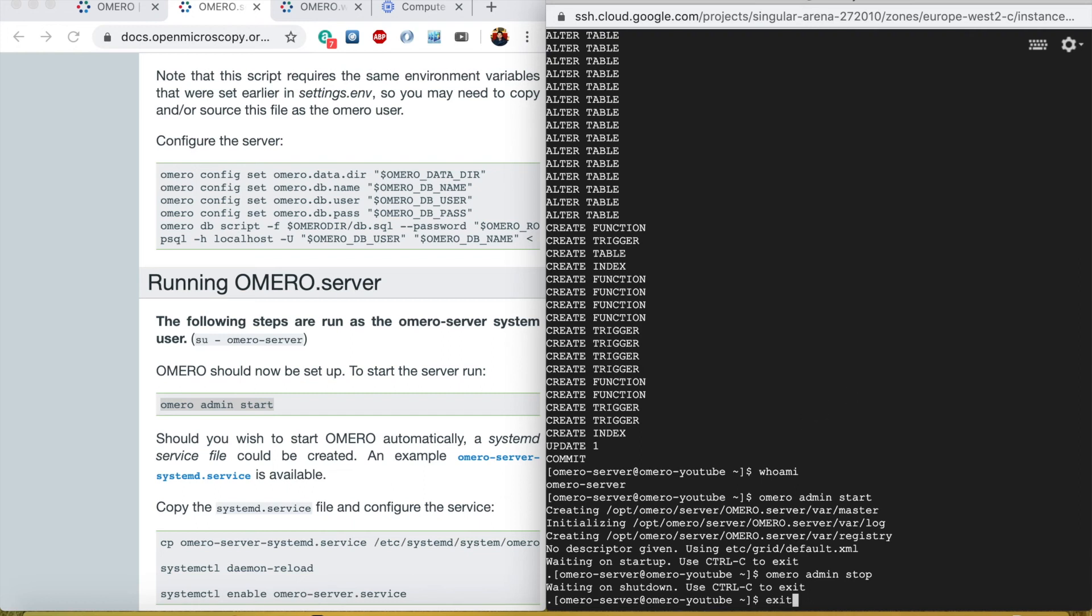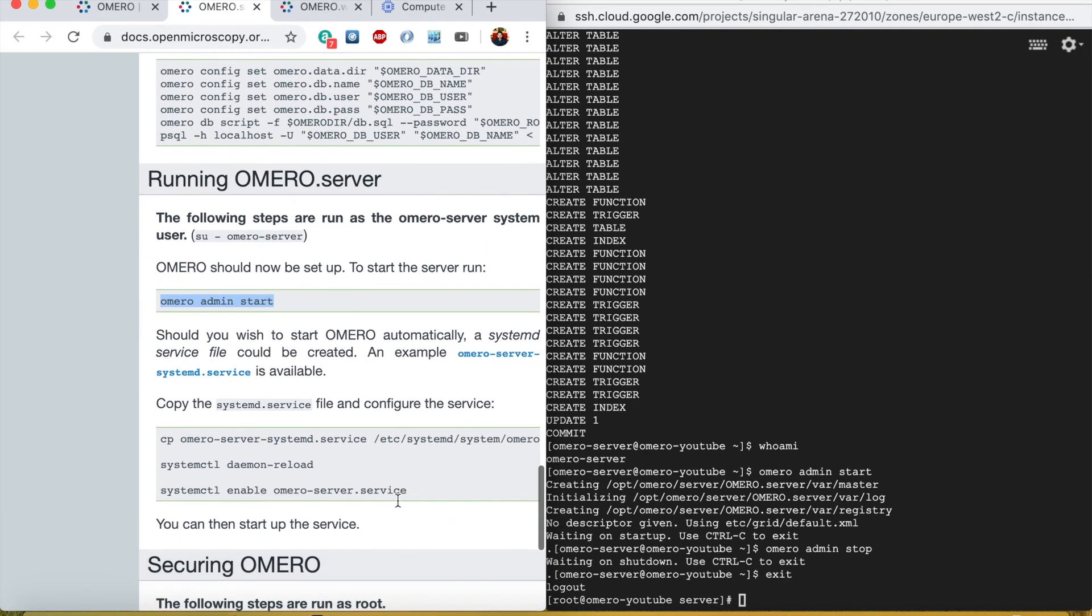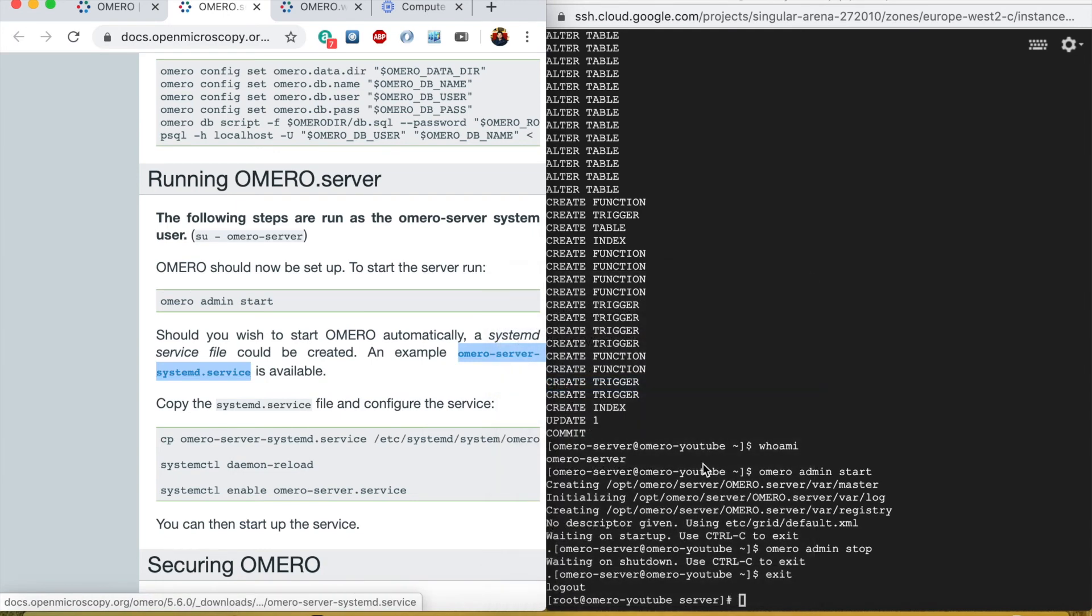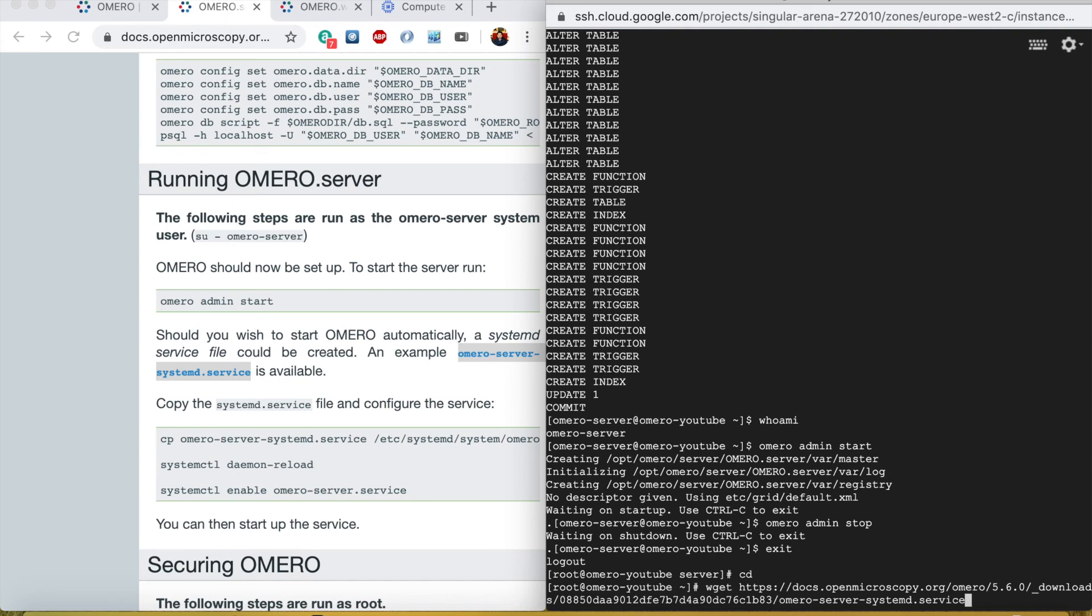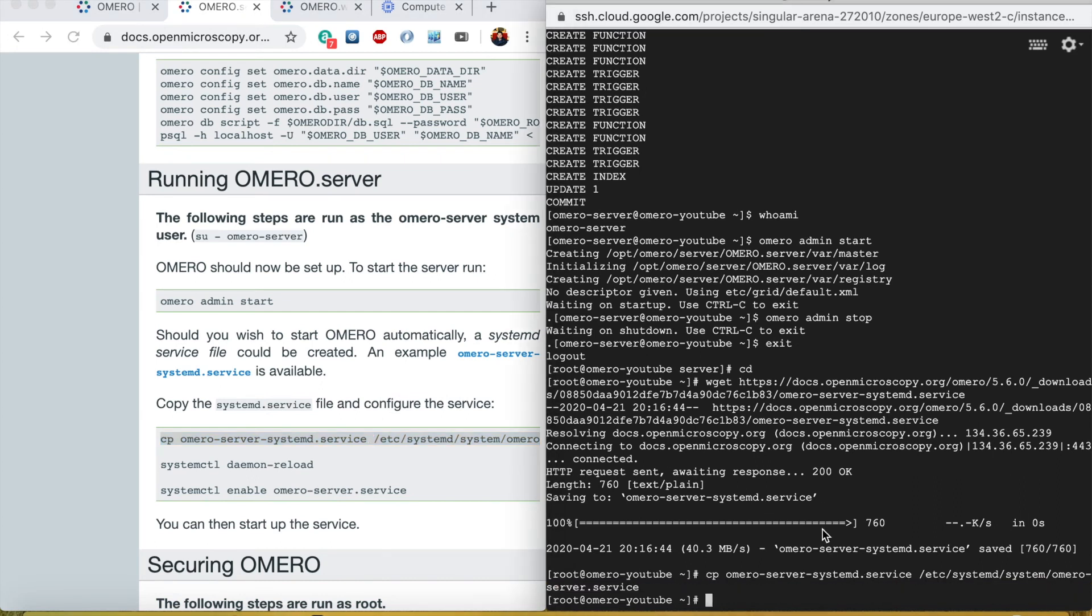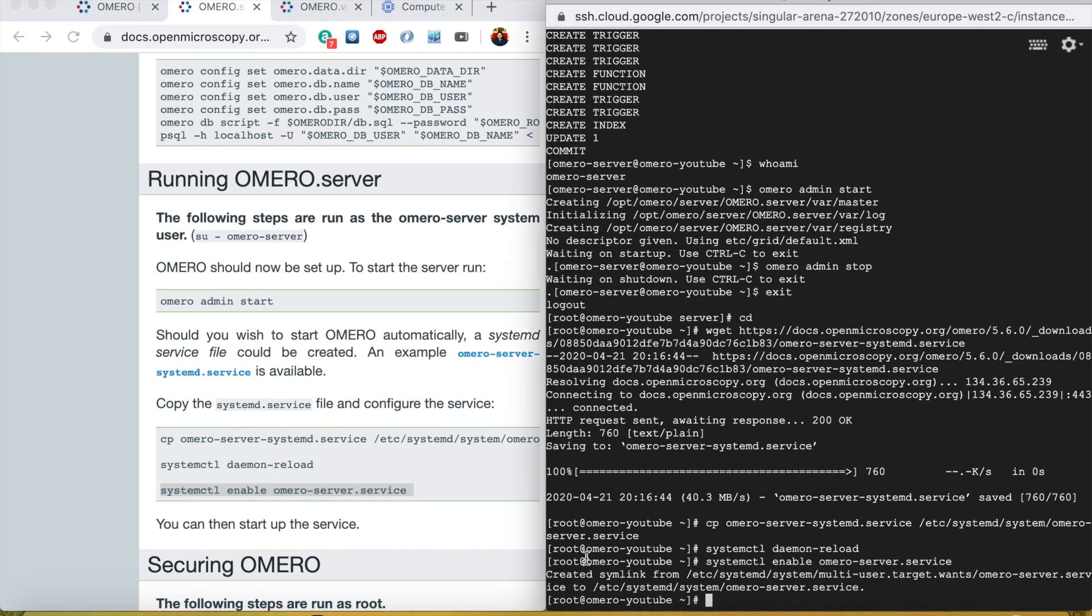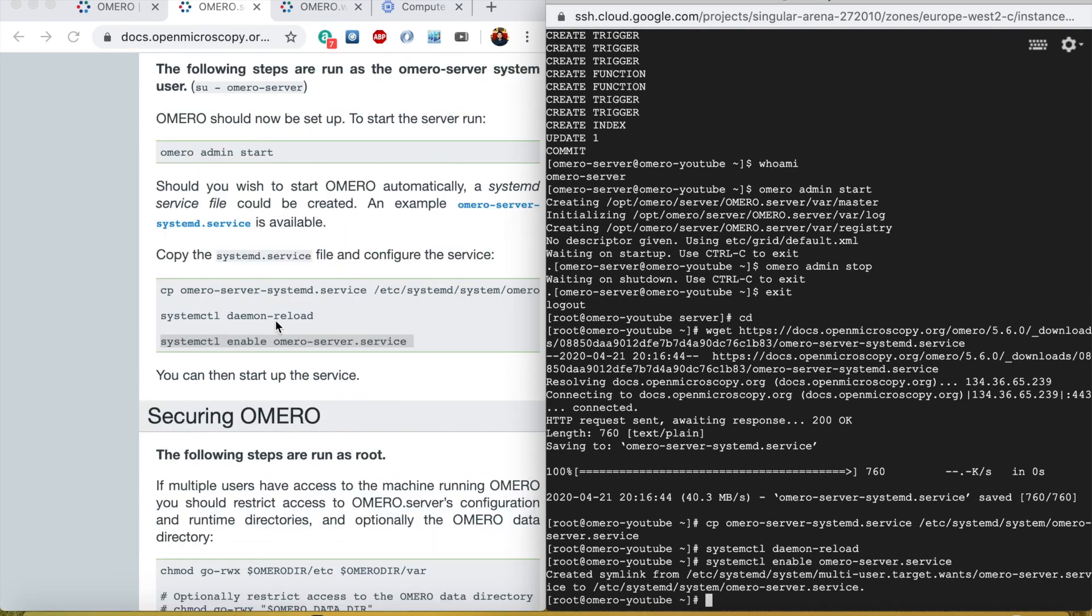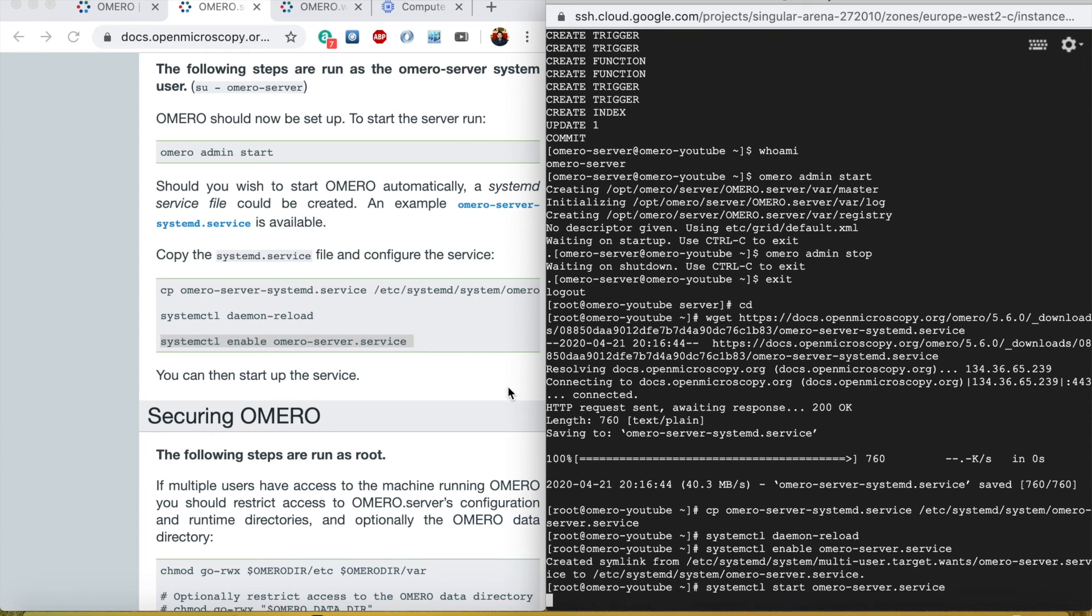We need to create a startup file. Copy the link address and press cd to make sure you are in the home directory. Now wget and paste that link. We got that link. We need to copy it to the OMERO directory. I copied it. Now we need to reload the systemctl daemon, enable it to start on the boot, and we can start it.